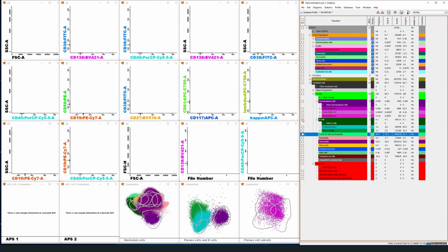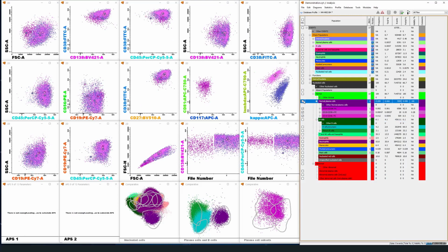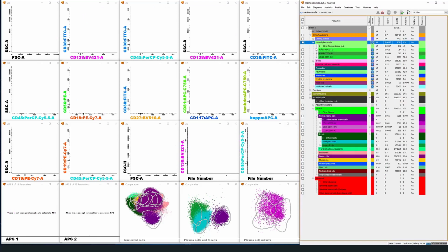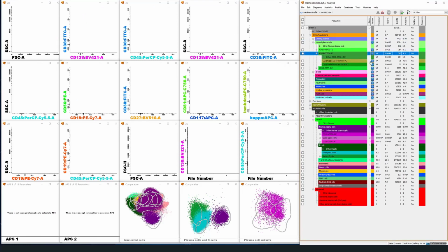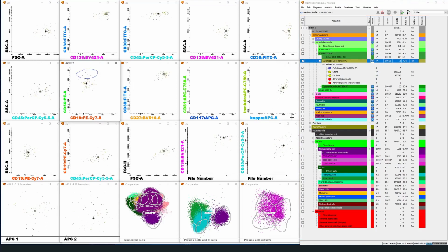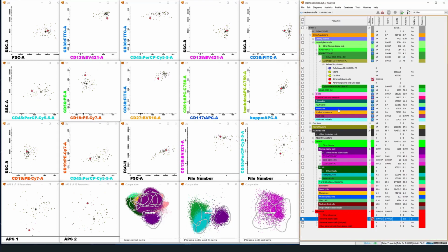Paying special attention to things that may be closer to plasma cells in their phenotype, and especially the automatically assigned normal plasma cells. One thing I noticed here is there are some cells that are CD56 bright, and we'll come back to that. As I've mentioned previously, bright cells with CD56 may be a sign of malignancy. So here I also see some CD56 bright cells, and I'll just temporarily assign them to abnormal cells, and I'll look through the rest of the populations, and I'll come back to that.